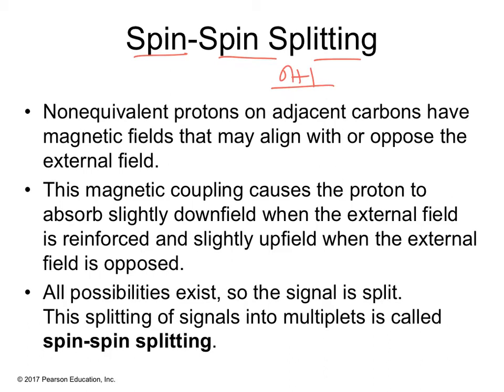It's your neighbors. And what happens is, when your neighbor hydrogen, okay, so what happens here? We'll just look at something like this. This carbon here has a neighbor carbon, so this is the neighbor carbon.